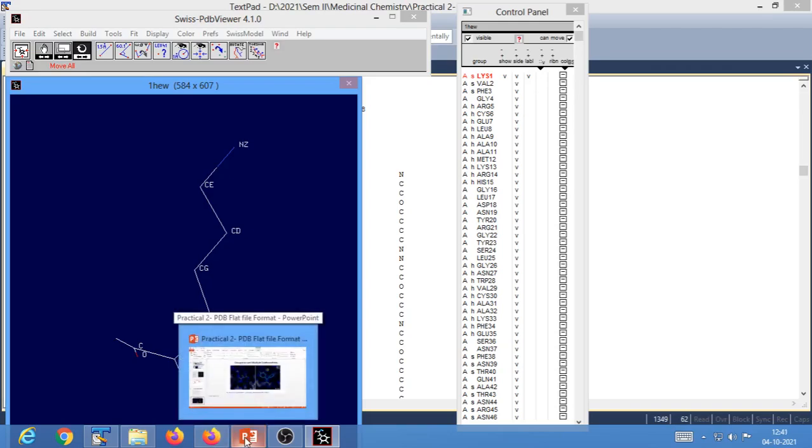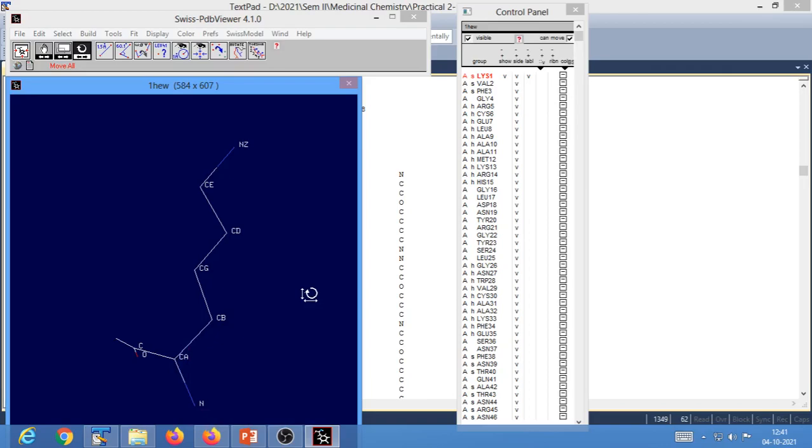Okay, so since the electron cloud is not detected from hydrogen, the spot of the hydrogen atom won't appear on your detector. If the spot is not detected, there would be no intensity for the hydrogen atom. If there is no spot and no intensity, you cannot obtain the electron density map of hydrogen atoms. No electron density map means that hydrogen atoms cannot be resolved in this case.